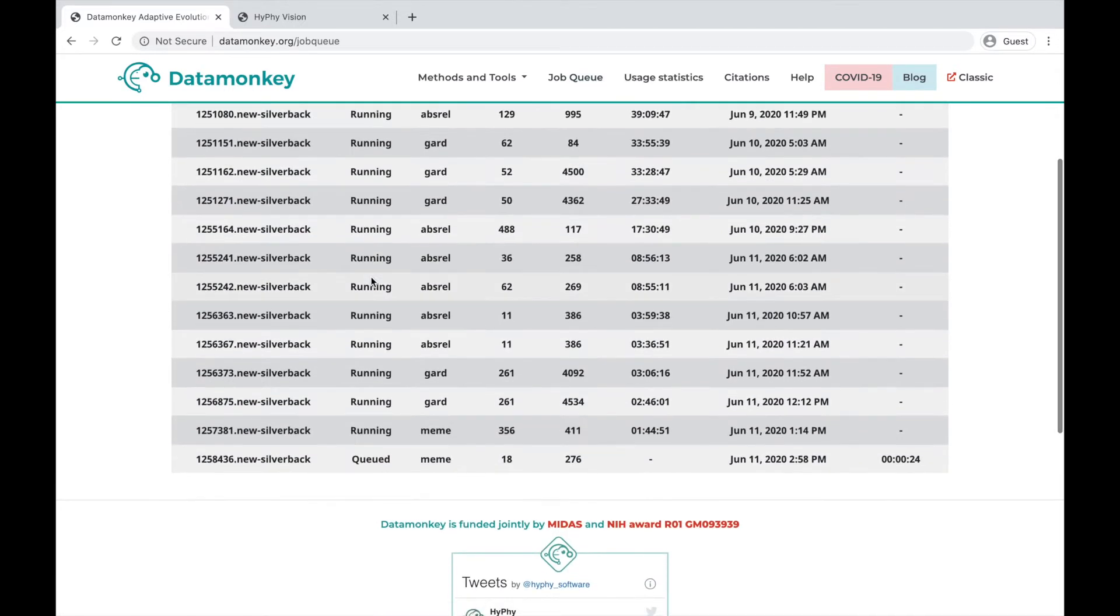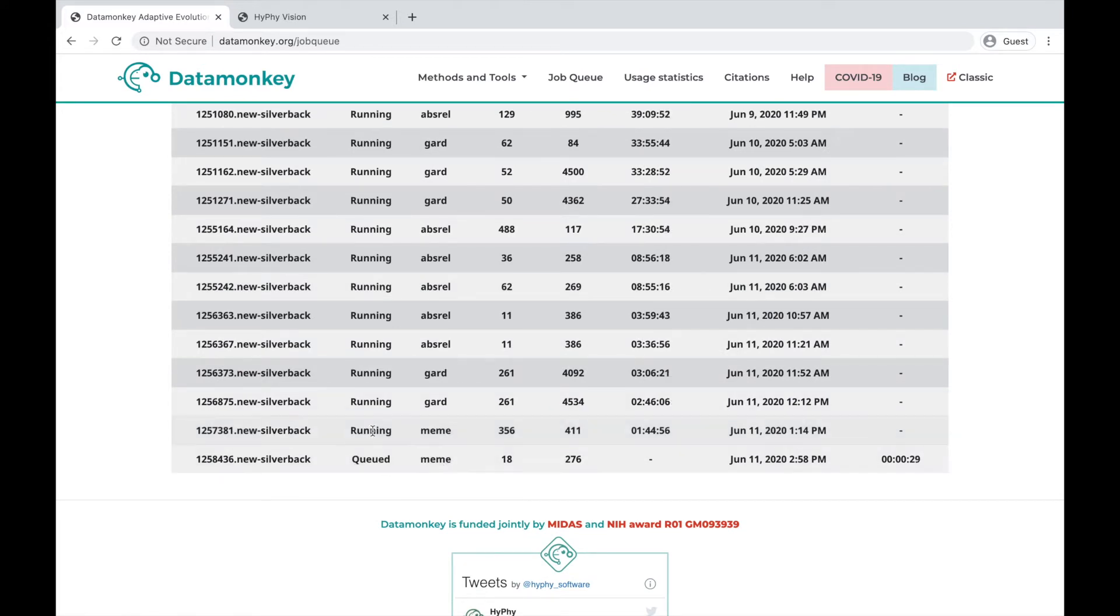If we scroll down, we can see that this Meme job that was just submitted is currently queued, while there's another Meme job here that is running.